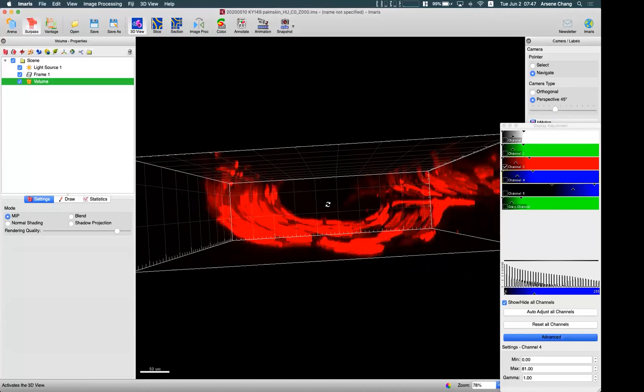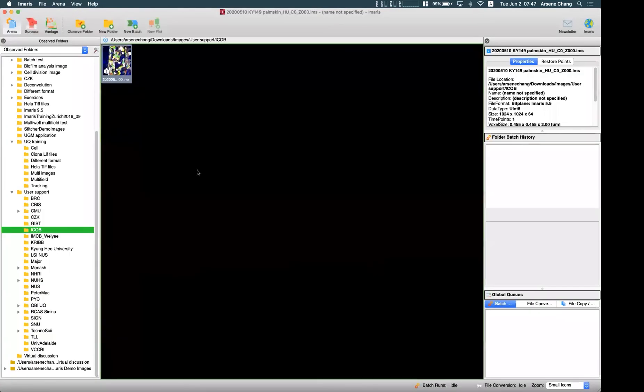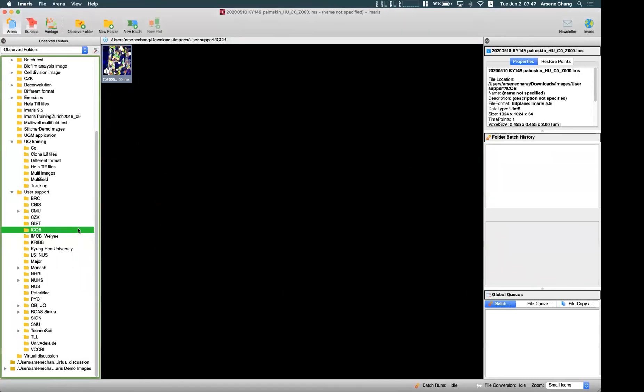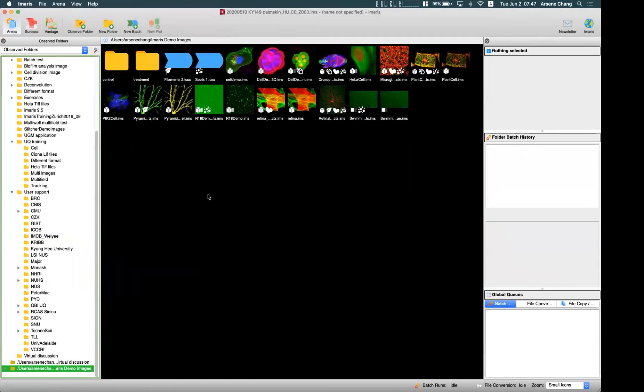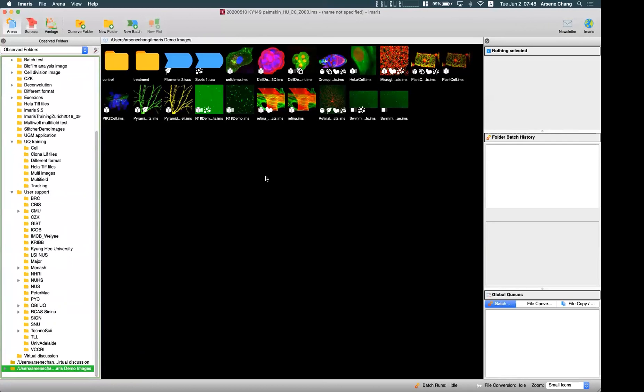So it is very important to ensure there is a closing in your membrane or cytoplasm staining, just to let Imaris know that is the real area of your cell staining and it will try to create a segmentation based on that specific staining. So that is quite important for the cell detection.